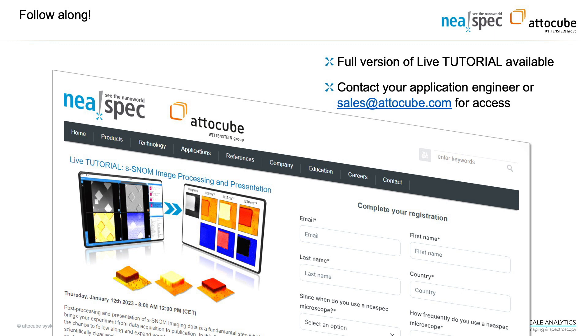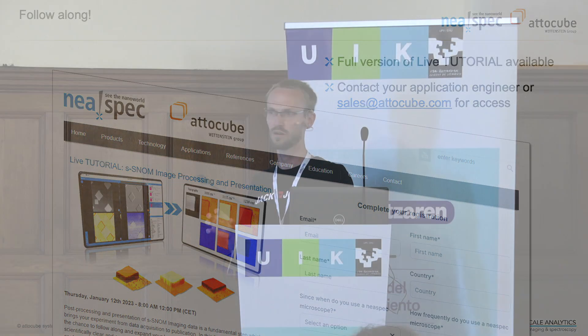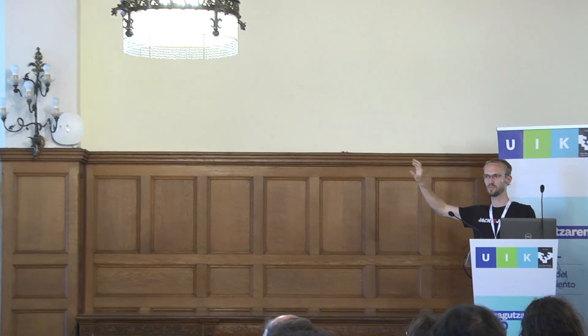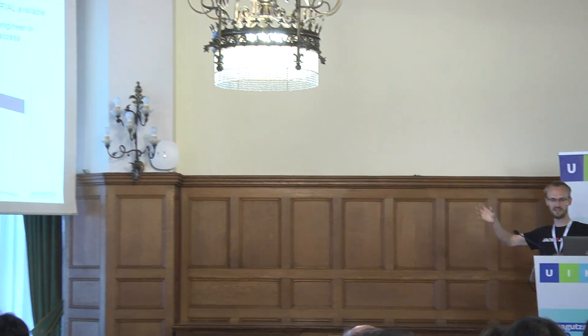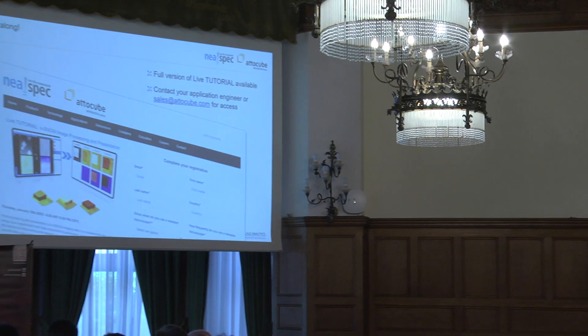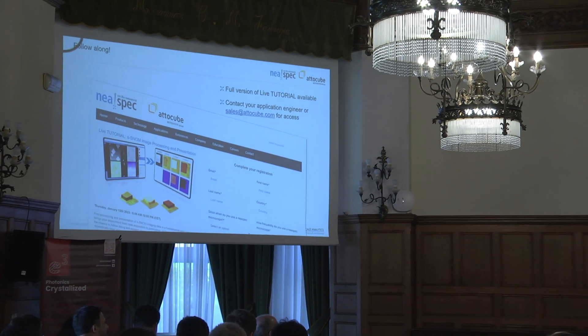You can speed it up in the boring parts, you can stop it in the difficult parts, and really follow along. On the website you can download some test data, so you will get exactly the same data that's in the webinar and hopefully get to the same result. My initial idea was to take this webinar and make a short version, but I realize it's not really useful.